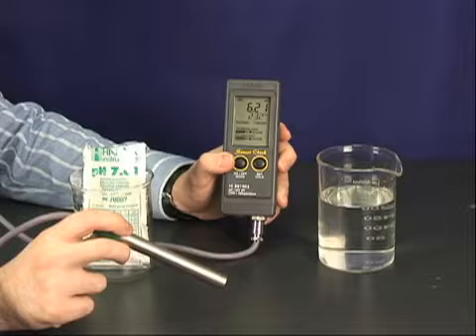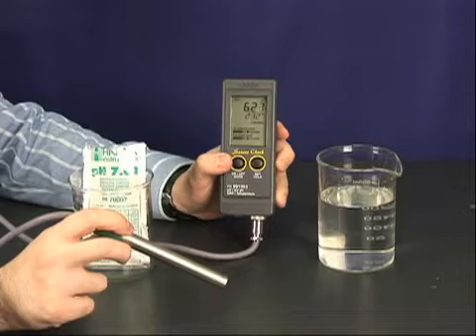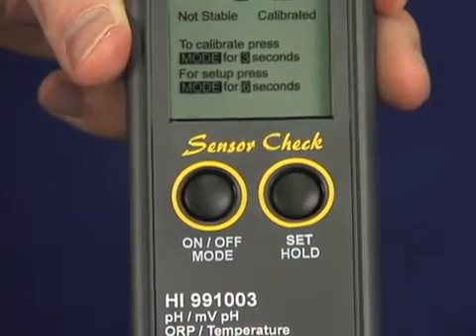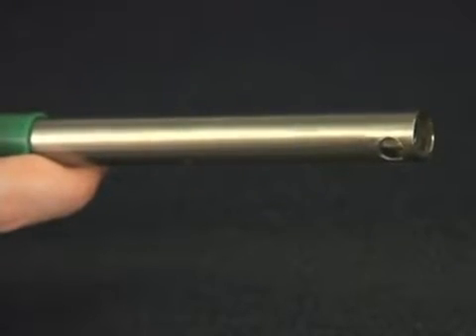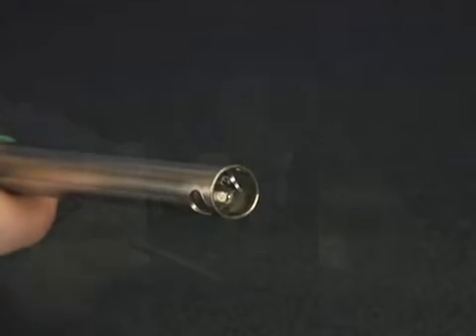The Hanna HI991003N is one of the most accurate and easy to use pH, millivolt, ORP and temperature meters. The meter comes with two buttons and a unique sensor check feature that allows you to determine your electrode status at any time. The titanium pH probe features a recessed flat tip that is easy to clean and prevents solids and solutions from collecting on the sensor.